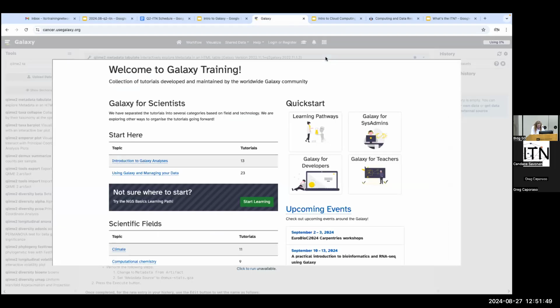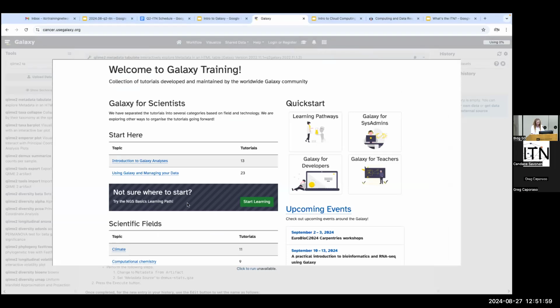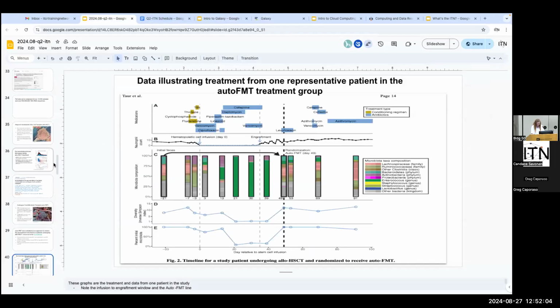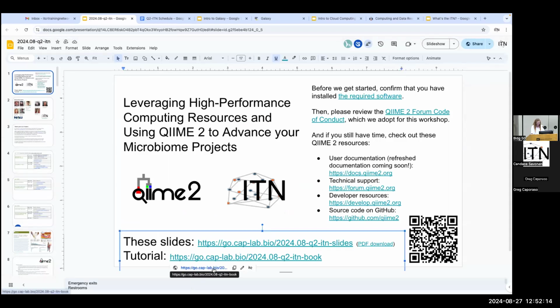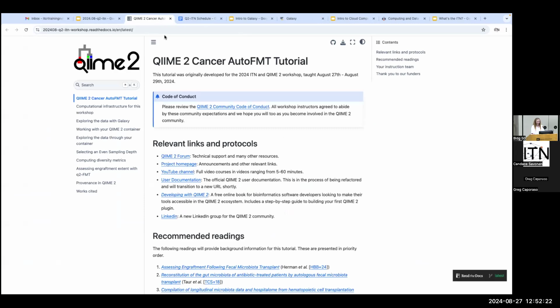Okay, and then do we have our tutorial book here? All right, so I'm going to also open our tutorial, if it will let me. And if you would like to also follow along with me, open your tutorial, and then we can go together through all of this.